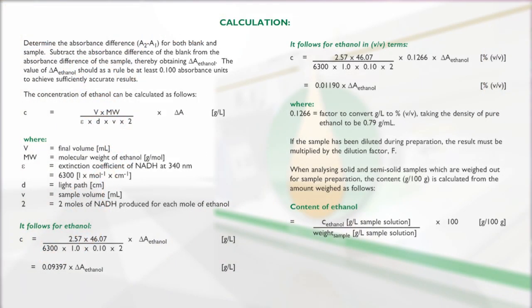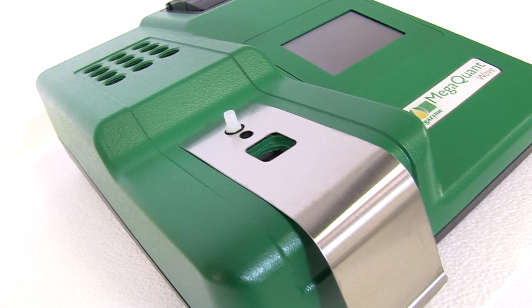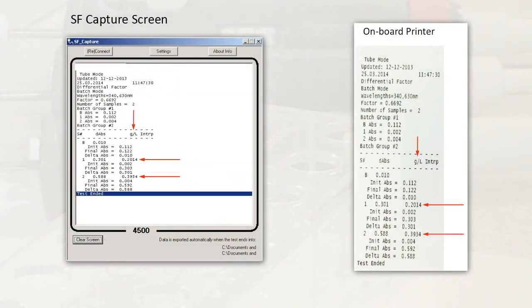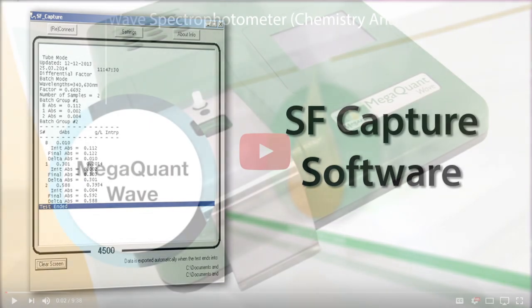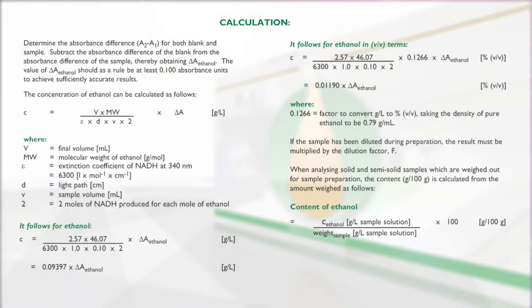The absorbance readings A1 and A2 of the sample and the blank reactions are used to calculate the ethanol concentrations in the original samples. When performing this test using the pre-installed protocol on the MegaQuant Wave spectrophotometer, results will be automatically calculated and printed via the onboard printer, or the data can be exported to a computer using the SFCapture software. If the results output are raw absorbance values, the calculations of ethanol content can be performed manually as described in the calculations section of the kit booklet.